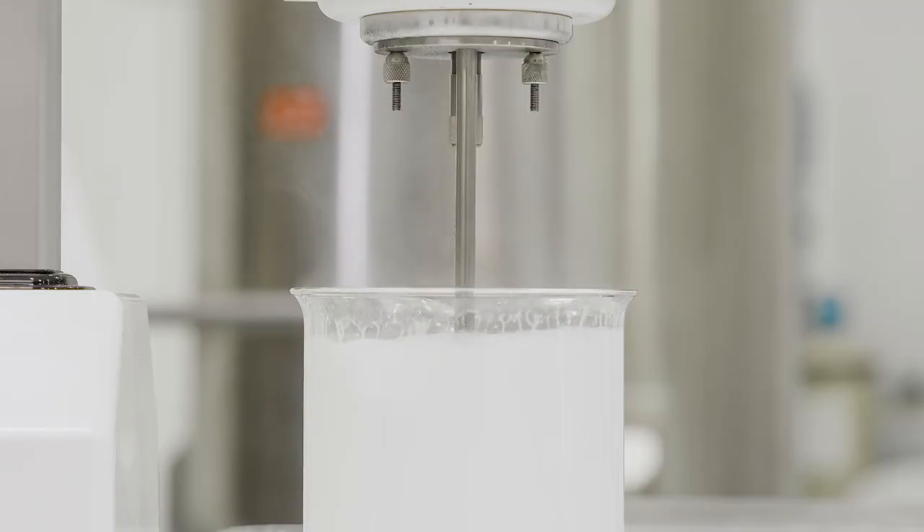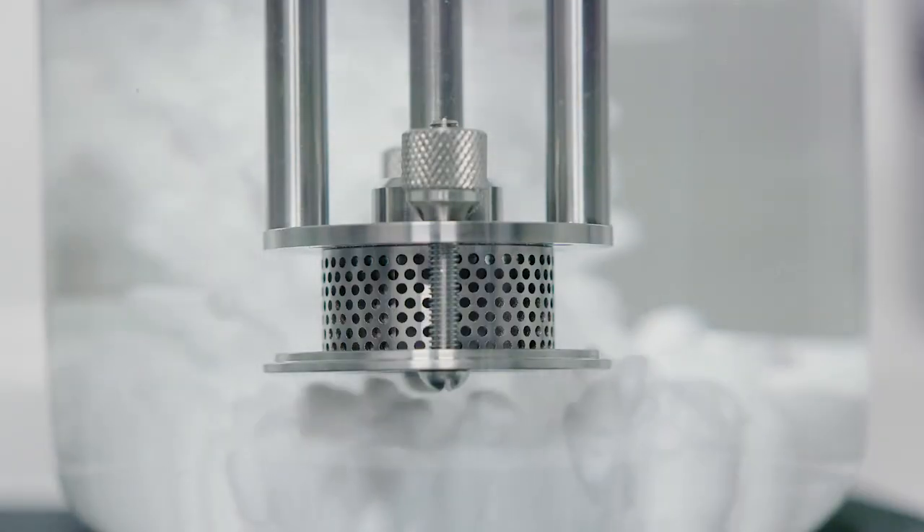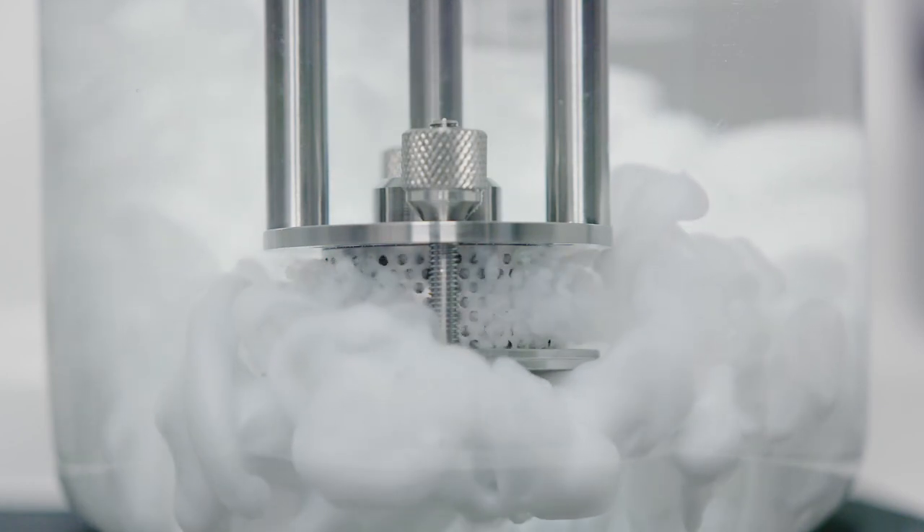Mixing is usually carried out at temperature so both phases are liquid when the emulsion is formed. To ensure stability it's essential to obtain the smallest possible globule size. A Silverson mixer is ideal for this.